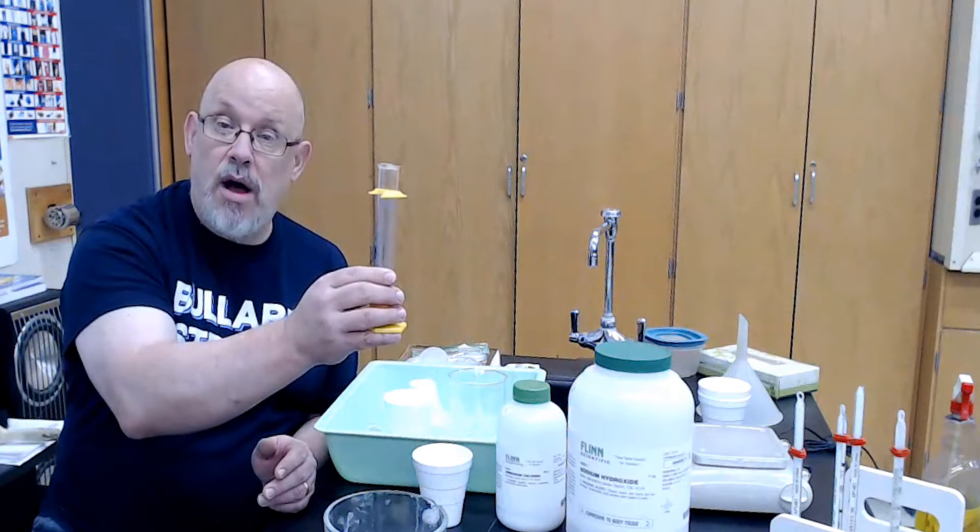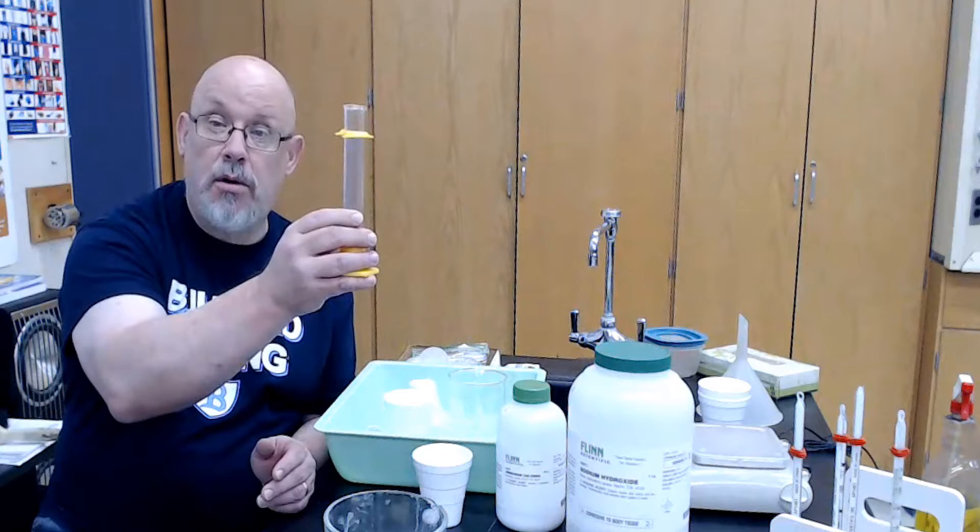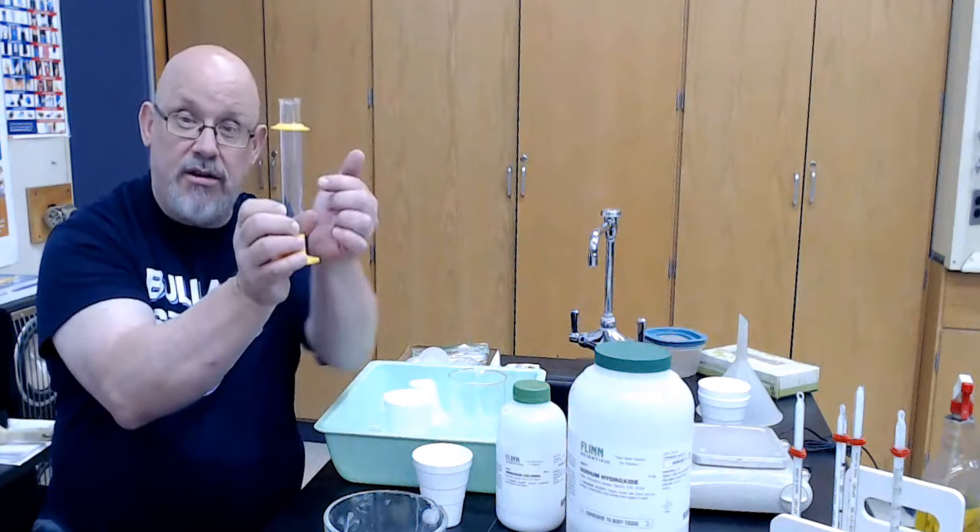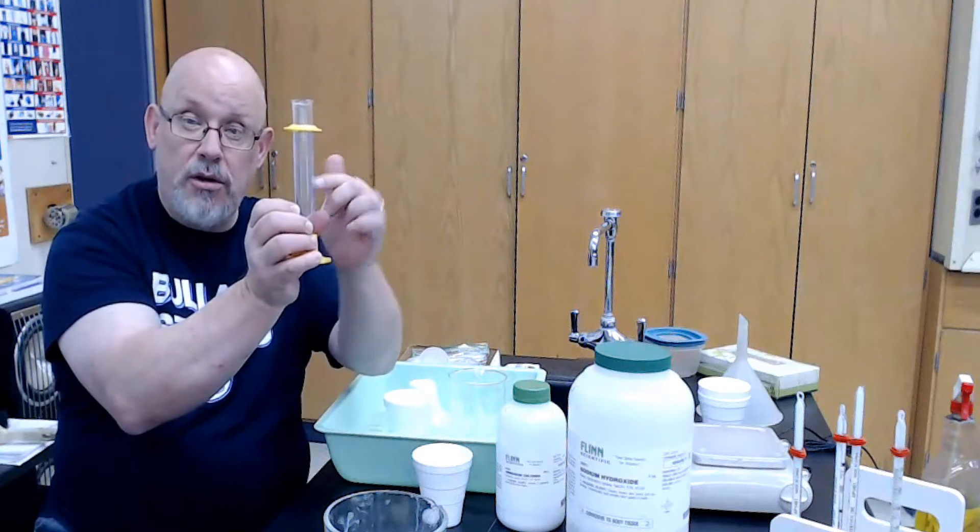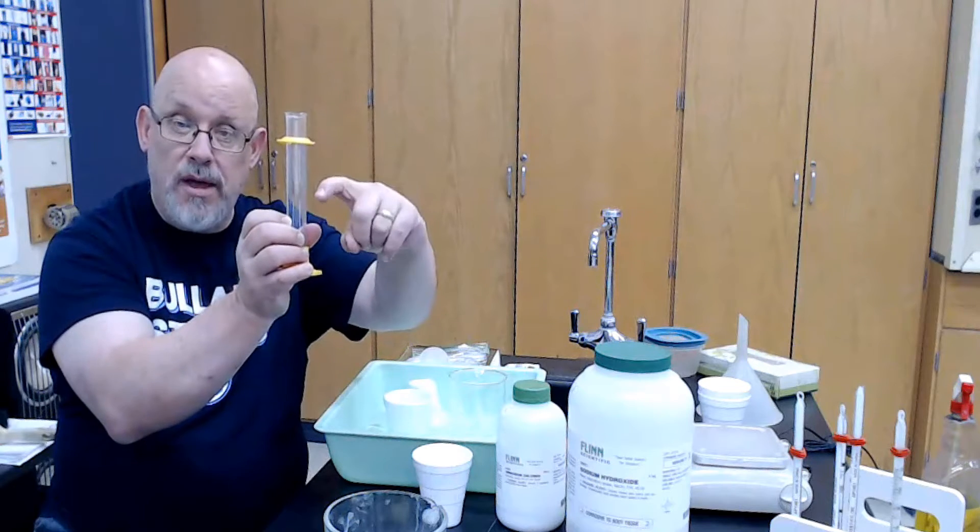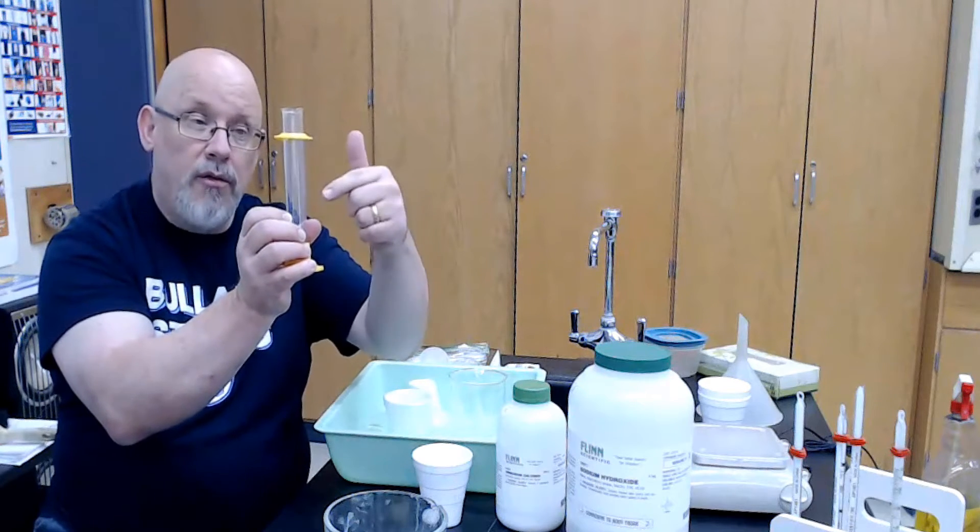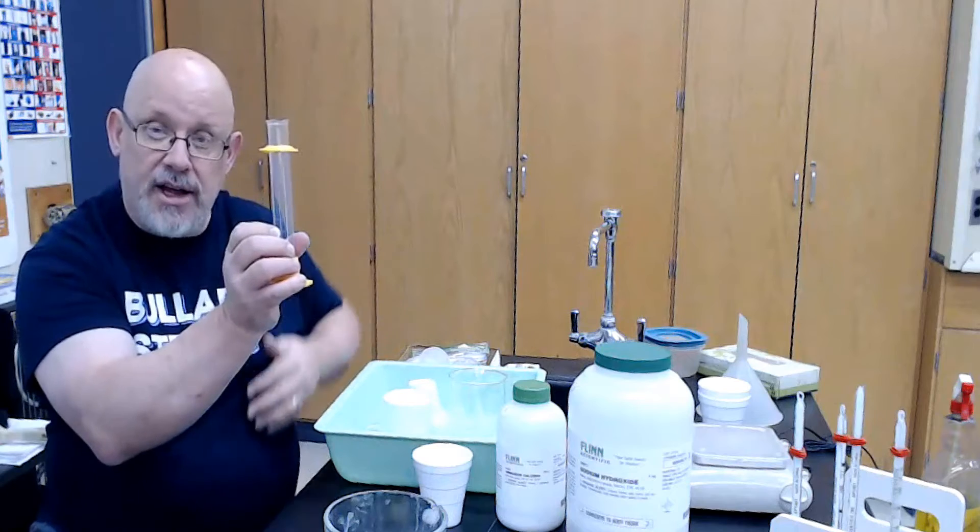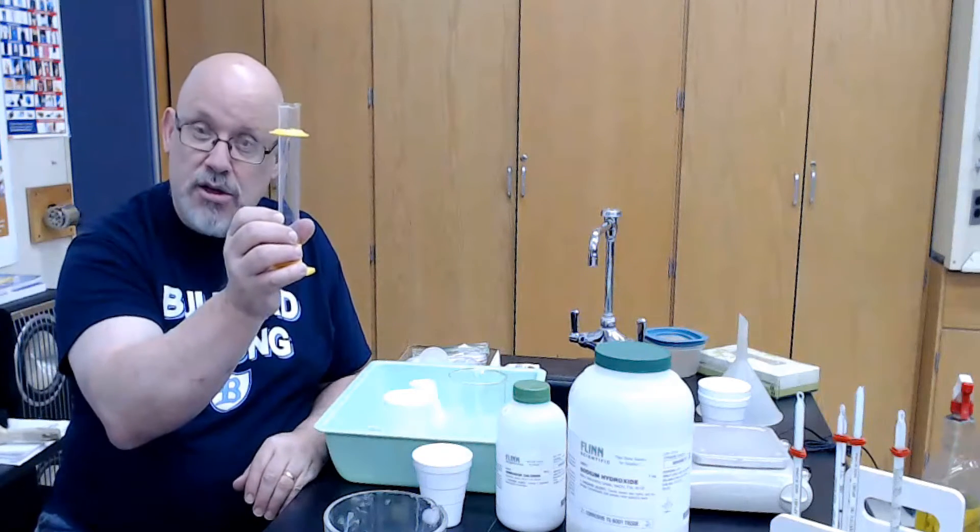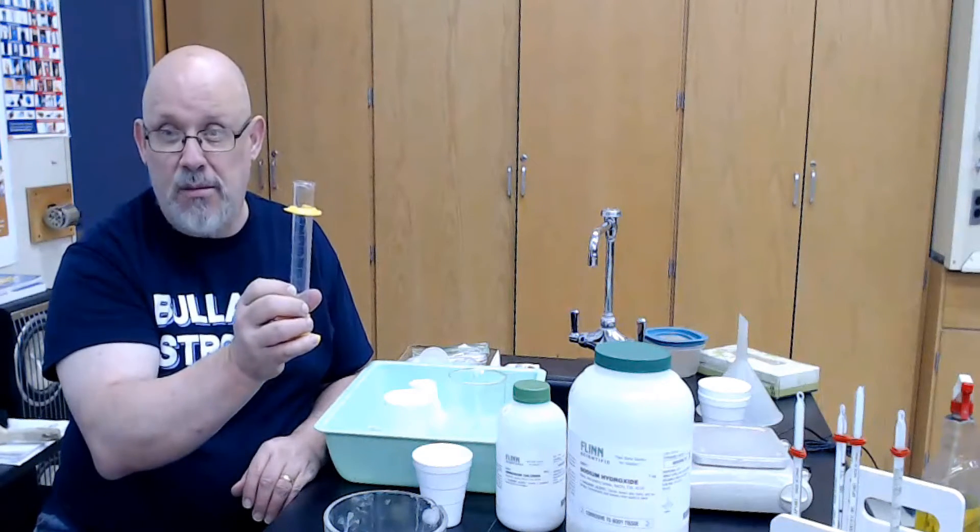As a video I'll be enclosing shows, it's important that the column of fluid that's inside the graduated cylinder, that column of fluid will not be perfectly flat. Instead it will be a curve and we want to look where the bottom of the curve intersects the lines on the graduated cylinder in order to measure the amount accurately. And the great news is, is that when you measure the amount, the volume of the fluid accurately, you are also accurately measuring the mass.